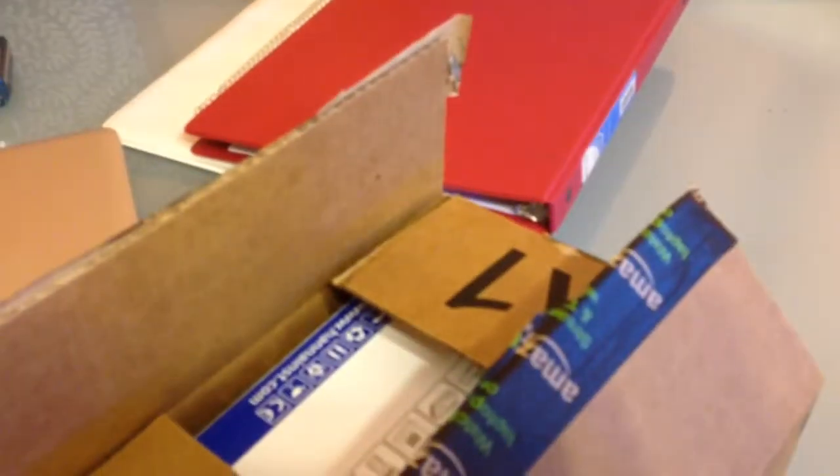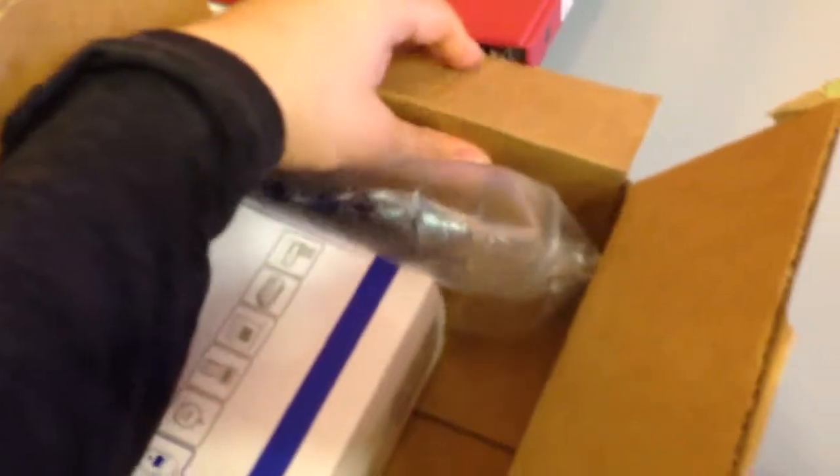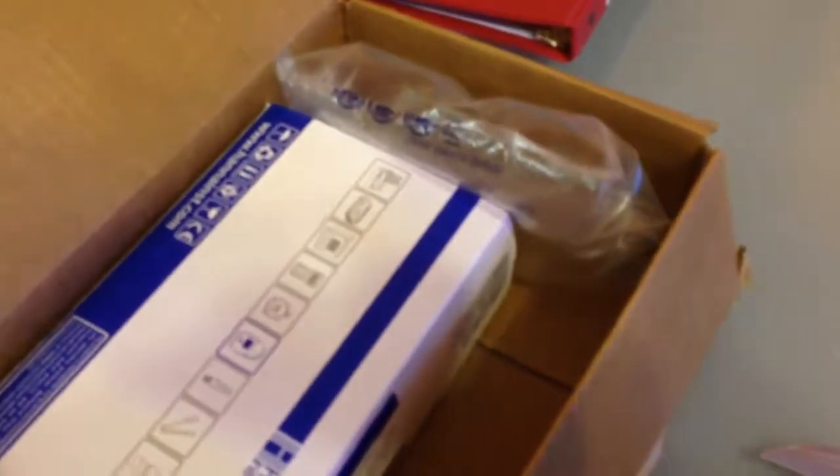This one was $41 on Amazon including taxes. I got it pretty cheap. I see them on eBay for like $50, $60, $69. Of course I want the cheapest one possible that still works.